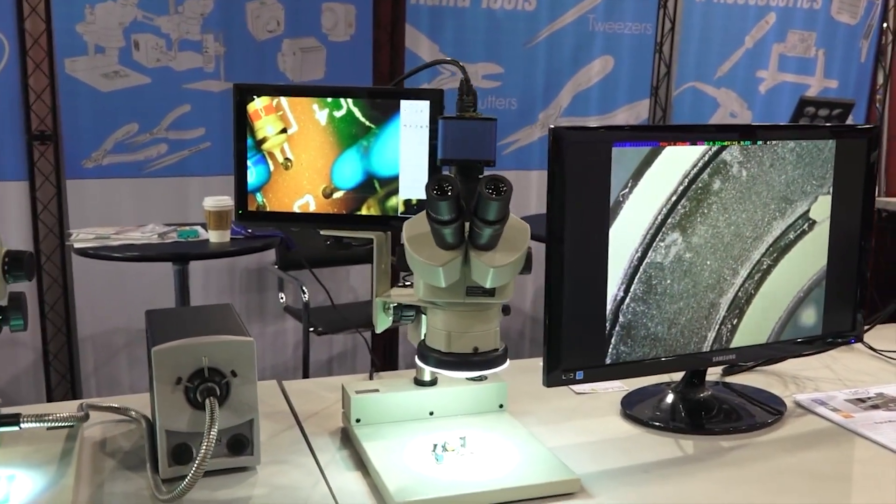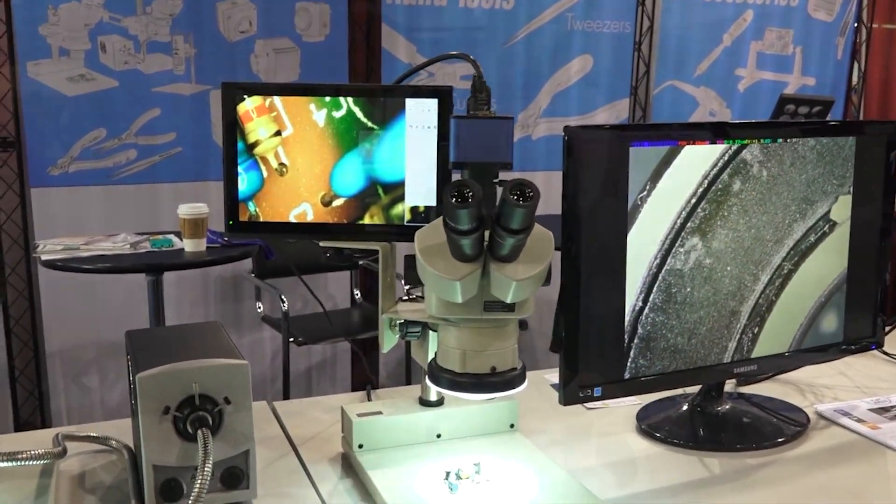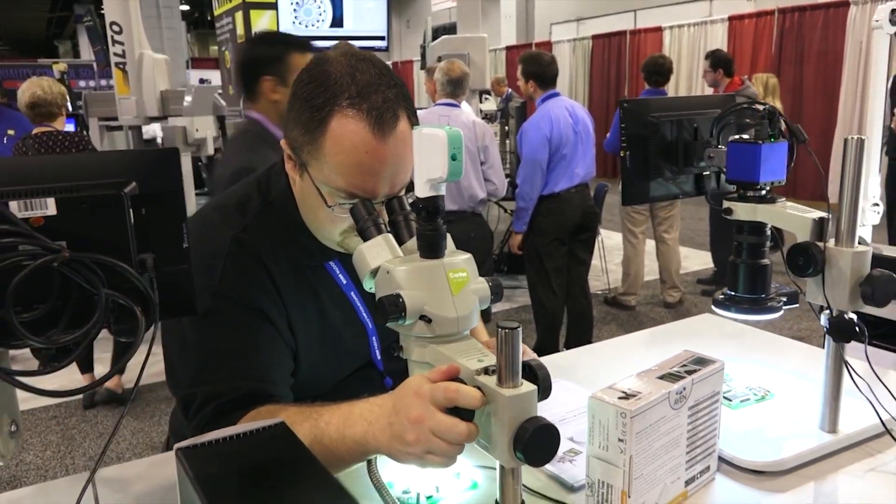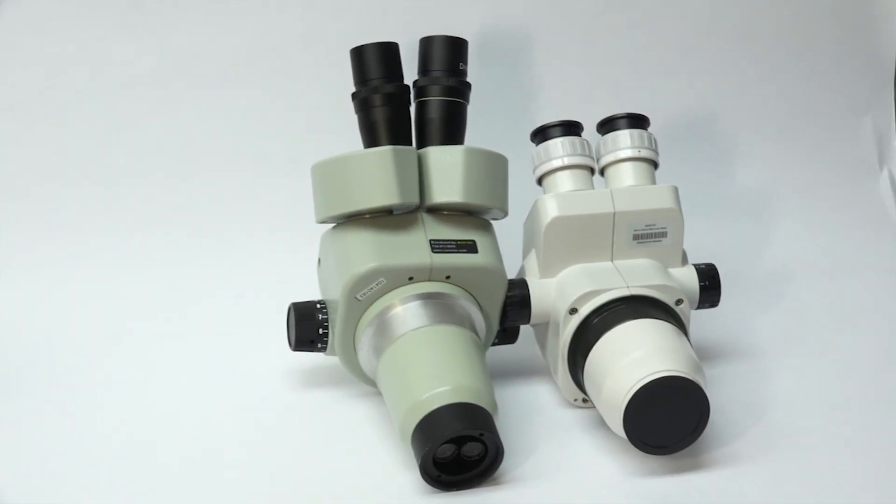Aven continues to be a leader in stereo microscopy with constant technological innovation and emphasis on quality and precision. One of the main reasons you want to buy our microscope compared to an economy one is because of the quality of the optics and the quality of the materials. Aven did what most won't try.